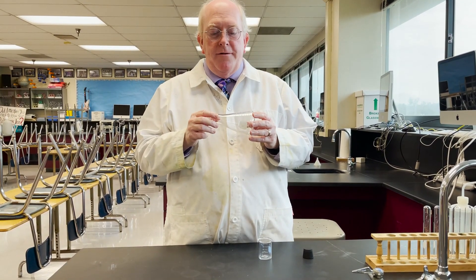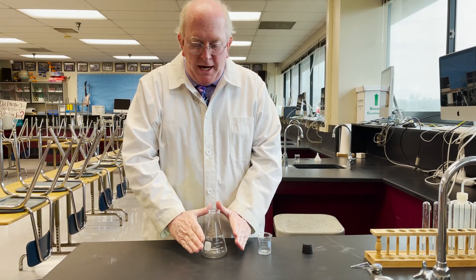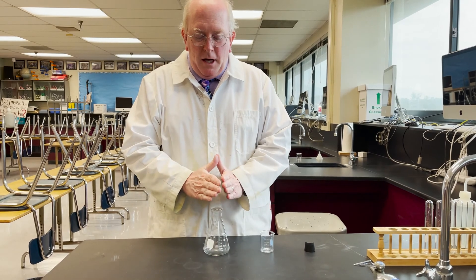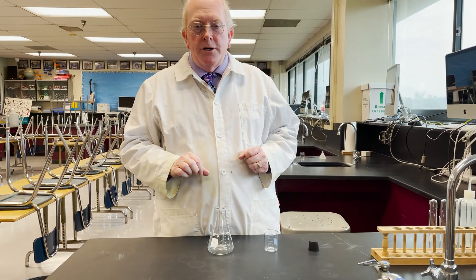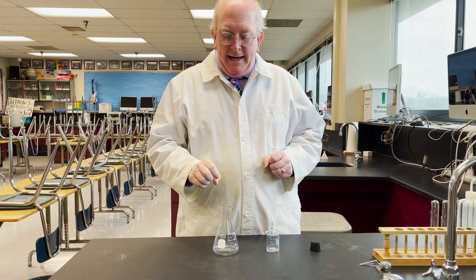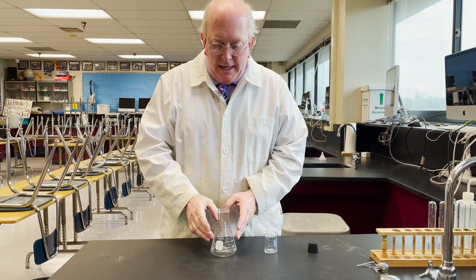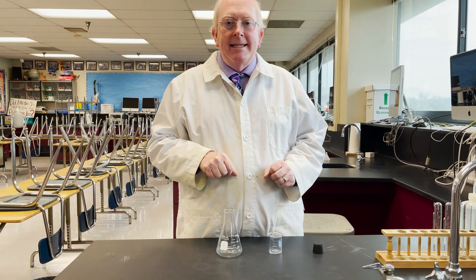It has this interesting shape that kind of flares up and inward so that the opening is not very large. So if we have one liquid in here and we're dropping another one in and it splashes, this shape helps to retain the liquids inside.